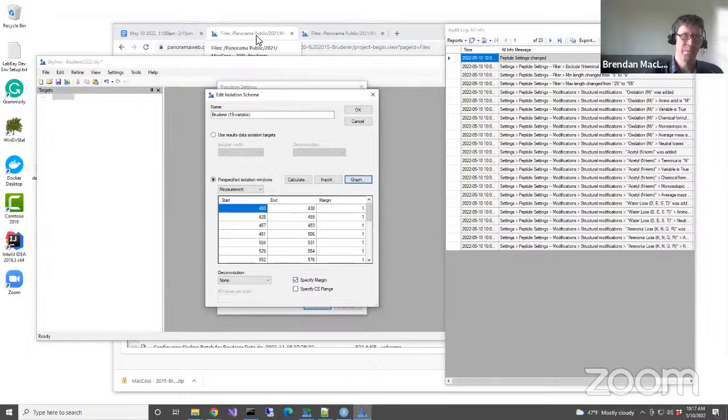That all looks good. Let's try the poll again to find out, was everybody able to get those 19 windows? Do enough people have raw data that was possible? All you needed was one raw data file out of that set, but you did need that. So let's check. Can I restart that one? Poll ended, untitled poll. Can I relaunch poll? Okay, here we go. So, okay to move on. That basically means yes, I have this isolation scheme. And if you don't have the isolation scheme, then you're not okay to move on.